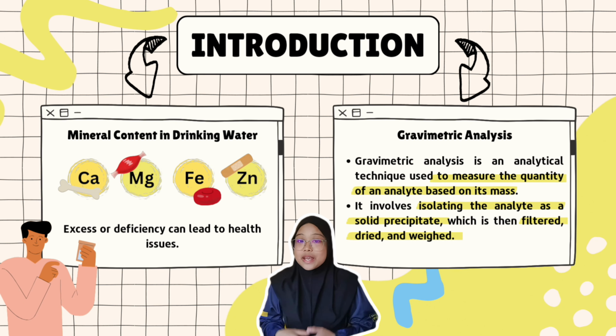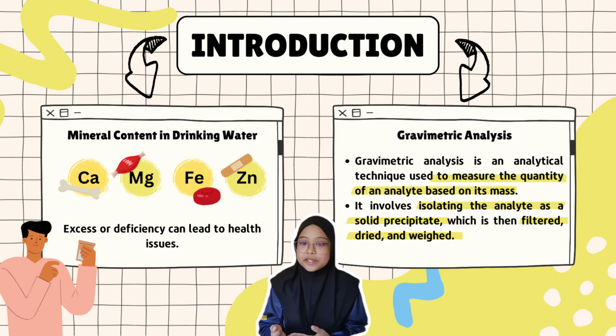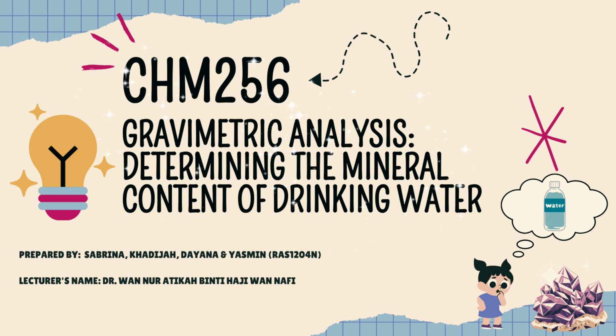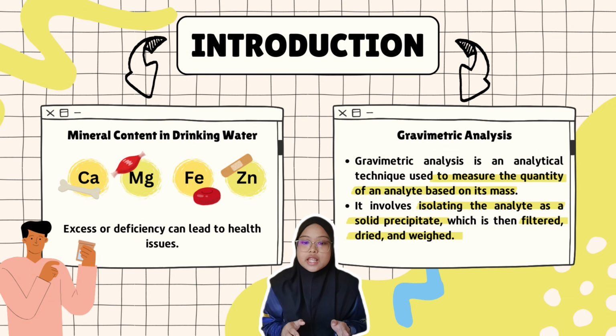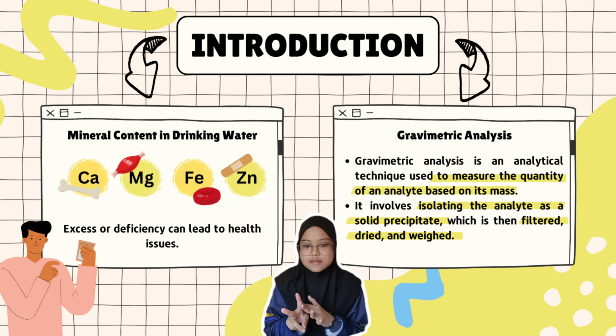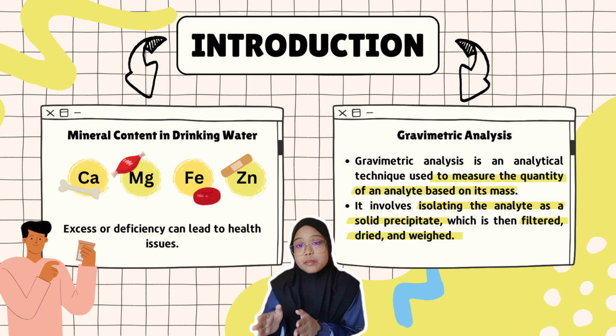Everyone, my name is Yasmin and today I'm excited to introduce our project titled Gravimetric Analysis in Determining the Mineral Content of Drinking Water. To grasp this topic fully, let's break it down into two parts. The first part is understanding the mineral content in drinking water, and the second part is about the gravimetric analysis itself.